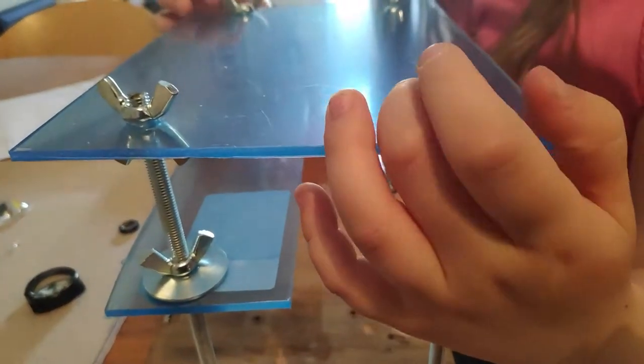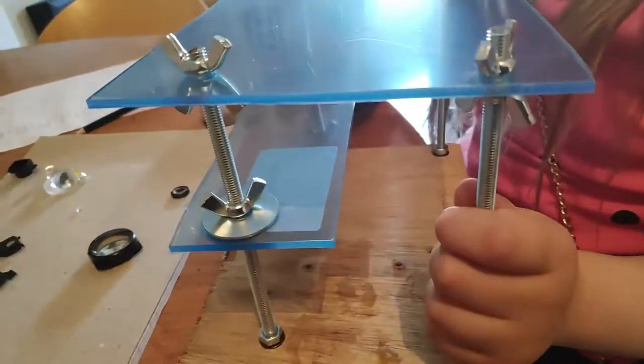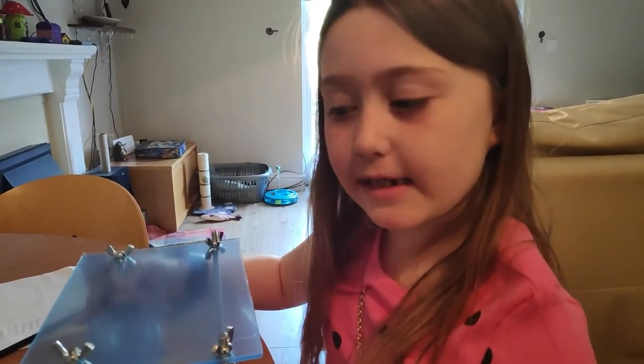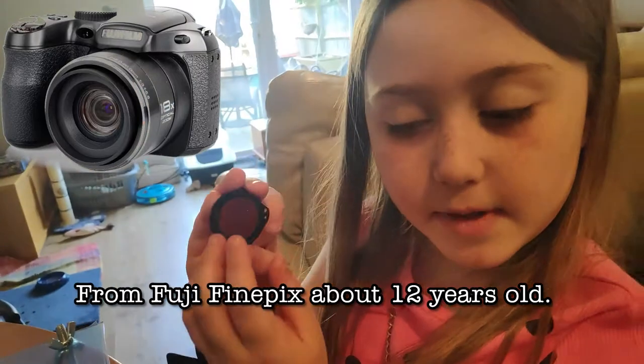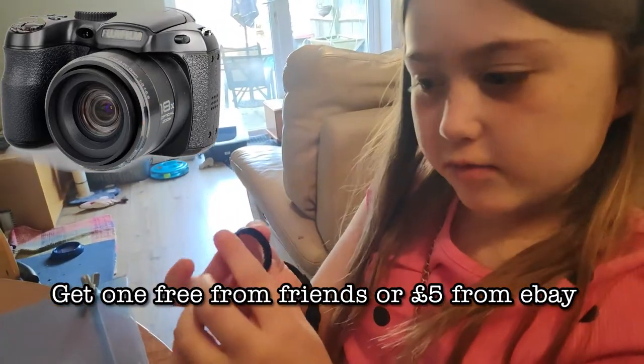And where do we get all these wonderful lenses? Well, my dad and Peter were taking apart some laser pointers, and we also got lenses from an old broken camera. This lens is from an old camera.